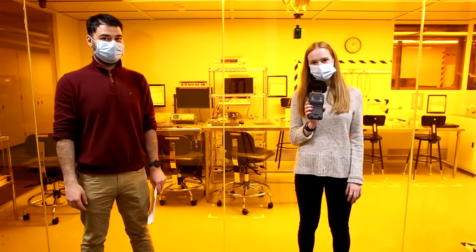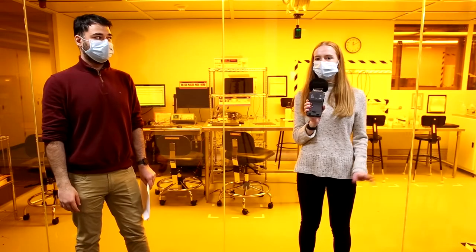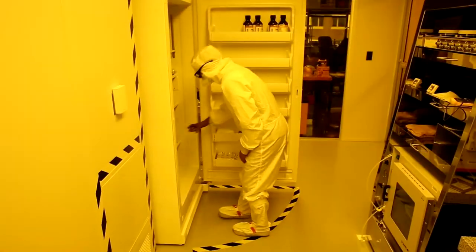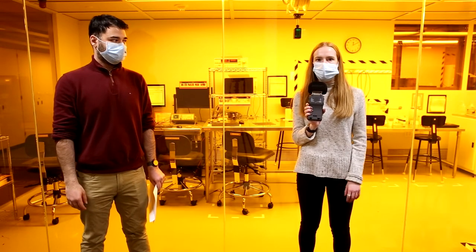Hi, my name is Ellen Long, and I'm the administrative assistant for the Conformable Decoders Research Group at the MIT Media Lab. My duties include various administrative tasks around the office, but in a clean room context, I mostly help with ordering and purchasing various chemicals and lab supplies, and also chemical inventory and just general lab maintenance.